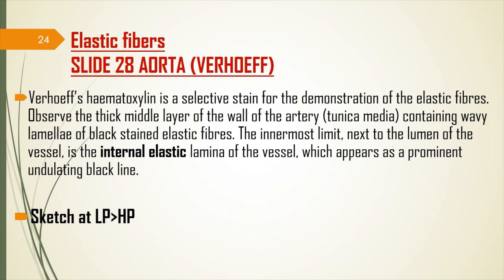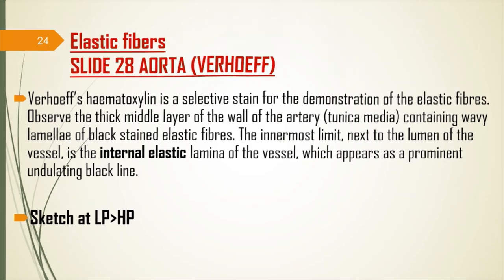The last type of fiber is elastic fibers seen in the aorta, demonstrated using hematoxylin staining. Observe the middle thick layer of the artery called the tunica media, where you find the elastic fibers. Remember blood vessels have three layers: the tunica intima with epithelium, the tunica media with muscle layer and connective tissue, and the tunica externa. Here we focus on the tunica media, which contains wavy lamellae of black-stained elastic fibers.